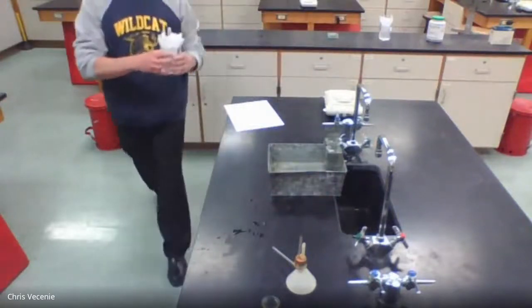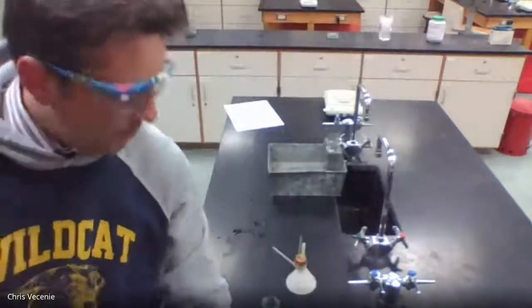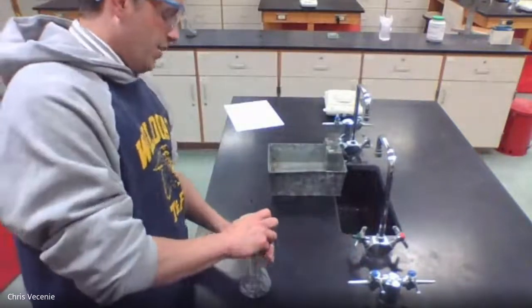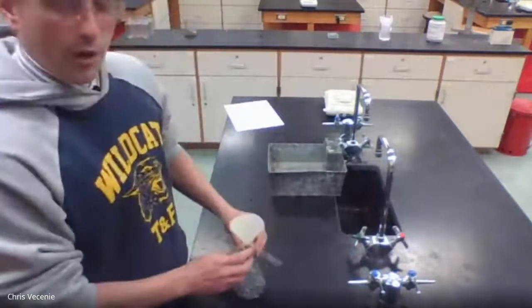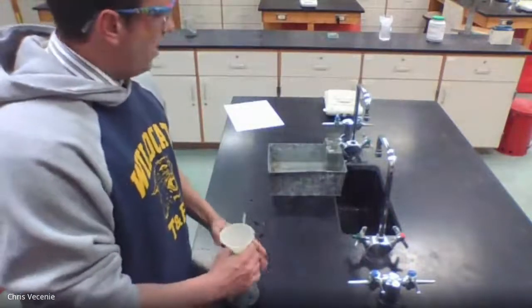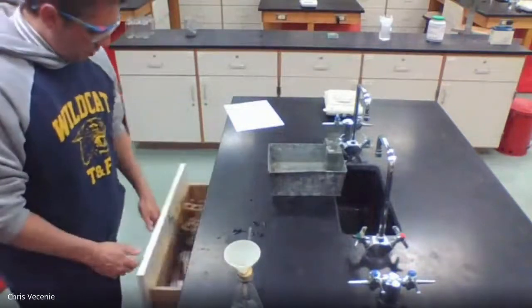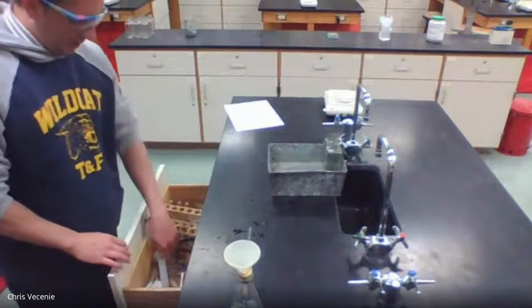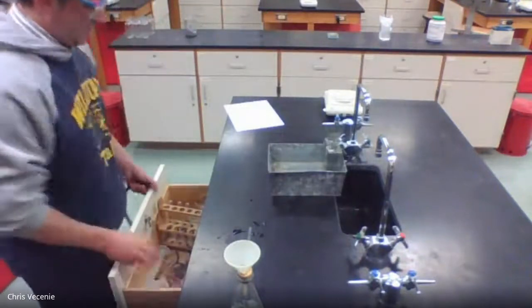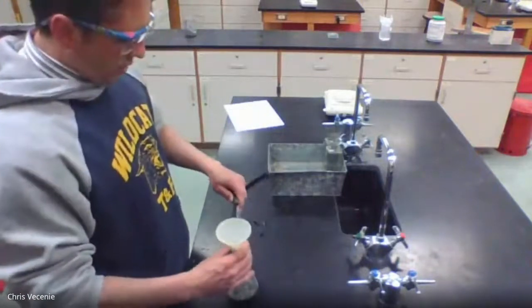All right, now I'm going to bring my acid over. You can see we're working with the 3-molar H2SO4. In terms of wearing gloves, the H2SO4 can burn me, to be sure, but it's not like the hydrogen peroxide where it's going to bleach my skin. So we actually don't need gloves for this one. We just need to make sure that if we see a little acid touch our hand, we wash our hands off. And at the very end of the lab, always make sure that we wash our hands.